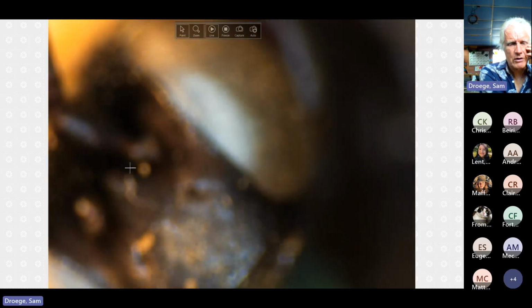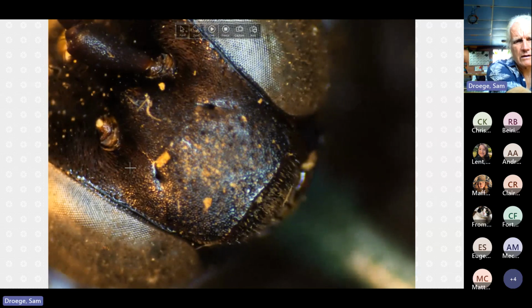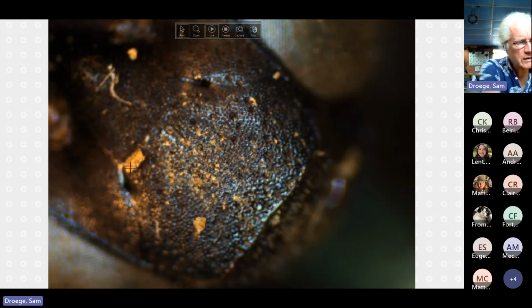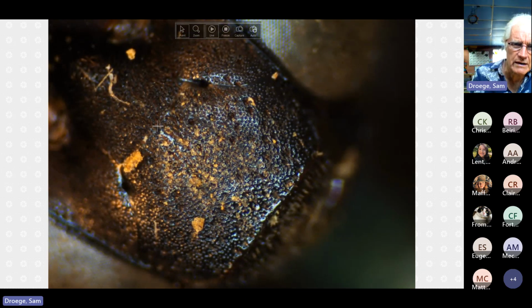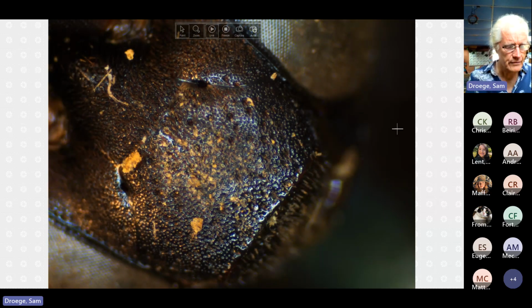So if you look towards the top now of the clypeus, I've scraped off a bunch and you can see a faint line there, but certainly it's faint. Eyeglasses on. It's a little bit tough with this lighting here, but I think mostly it's a lighting issue. So here's this line here and it doesn't really extend all the way in, but this was covered with goop. And so there's a bit of one. I think I am going to add it to being absent in the guide though.